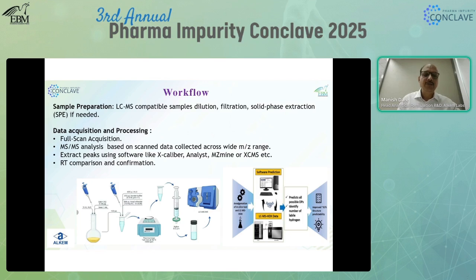And for data acquisition and processing, in ESI and APCI mode, full scan, we have to do it, and according to the impurity and the runtime, we have to develop the method. Using different software, impurity assessment, impurity identification and RT confirmation are going to be helped by this software.